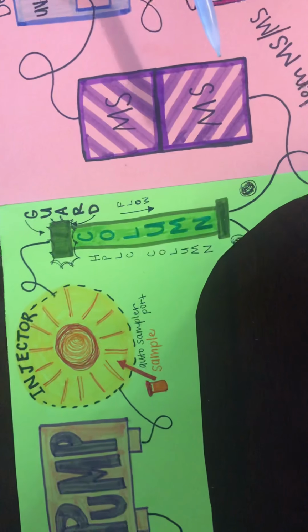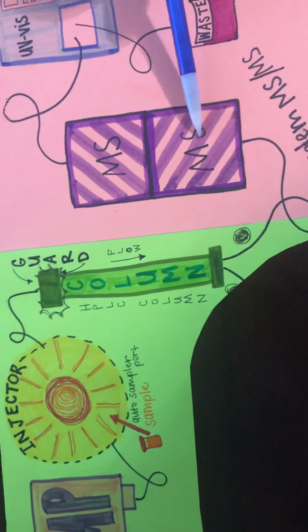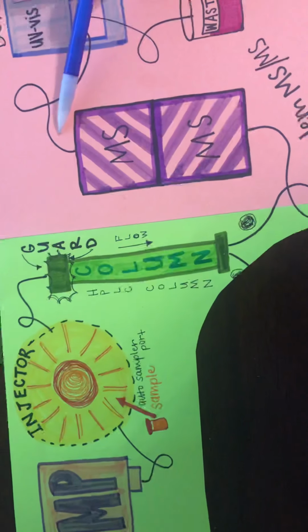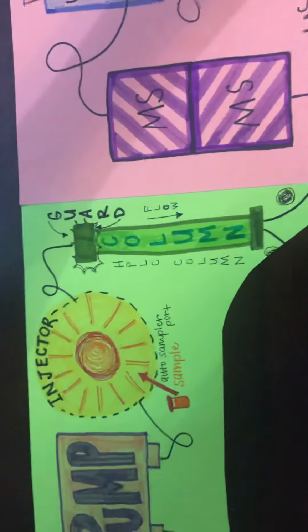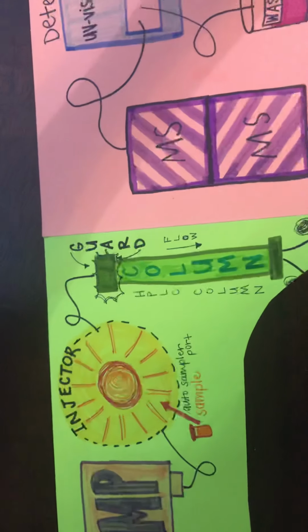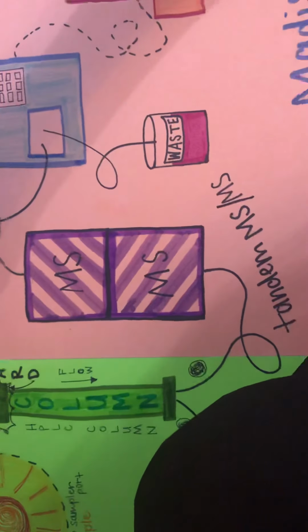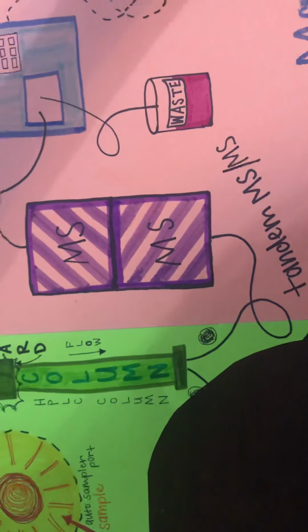And the first MS, this one, acts as a mass filter to get an initial reading of the components to find a possible parent ion, and the second one analyzes the compounds that fragment from the initial parent ion. And this info about the compound that we receive can help us work backwards to determine the parent ion from the fragmentation patterns. Now, tandem MSs break down selected ions into fragments, and the fragments then reveal aspects of the chemical structures of our ions.